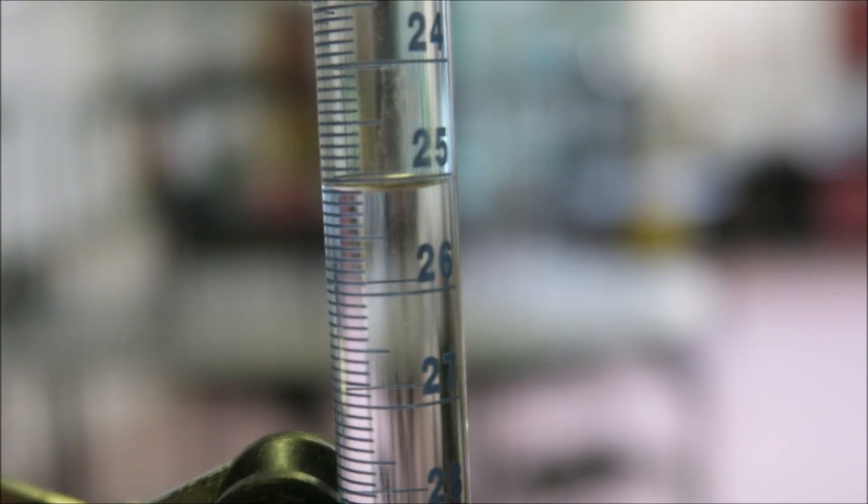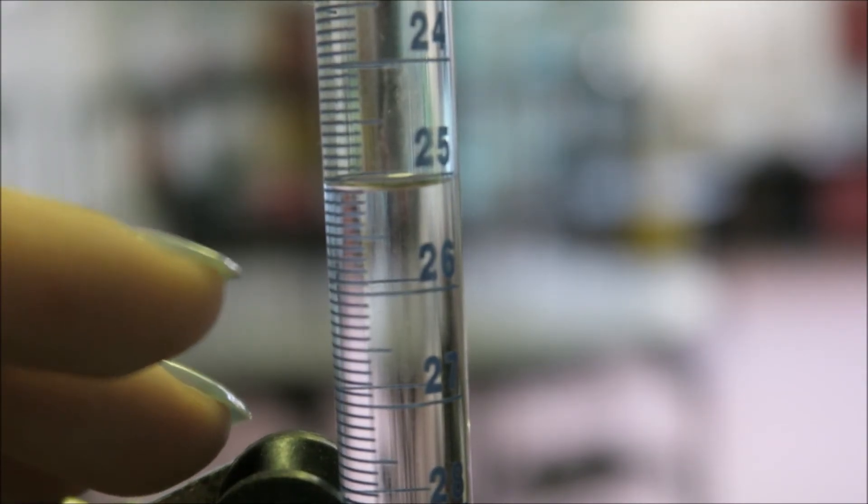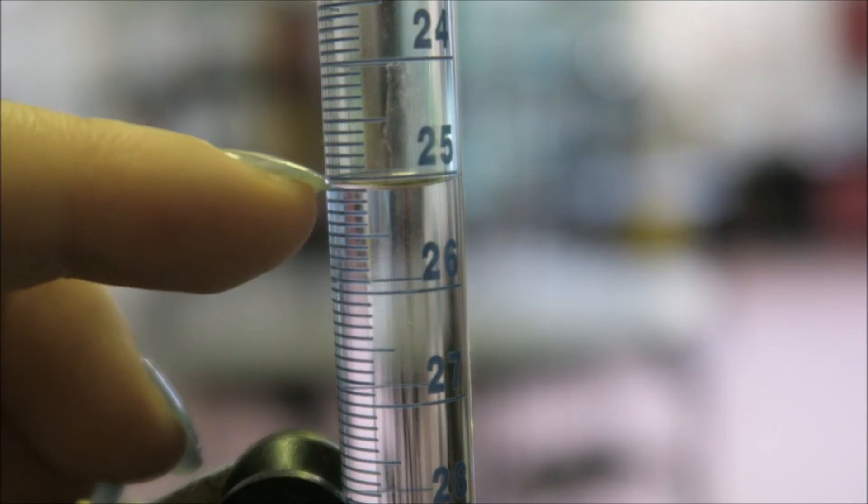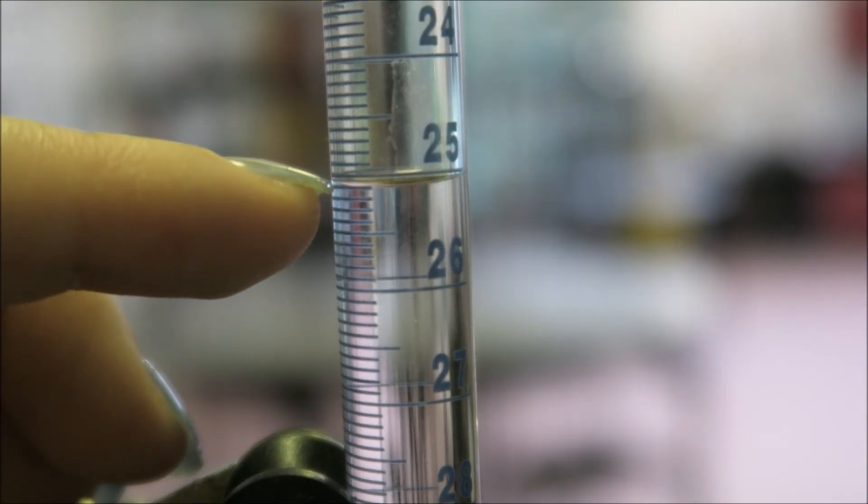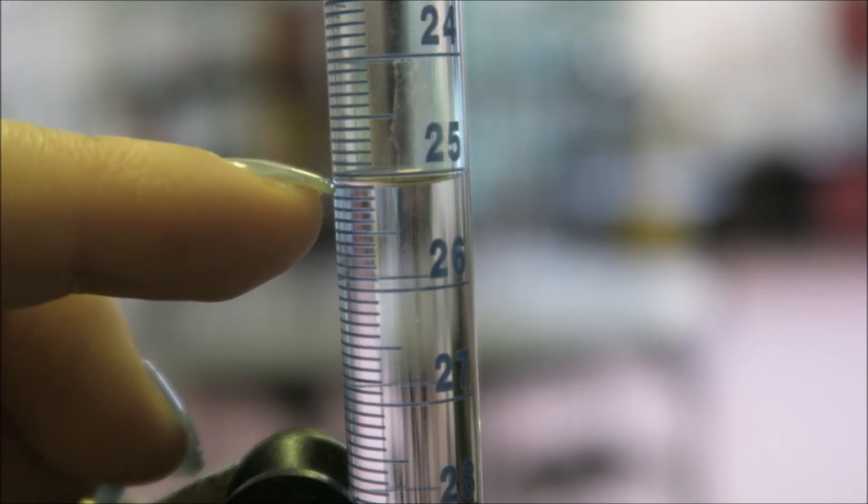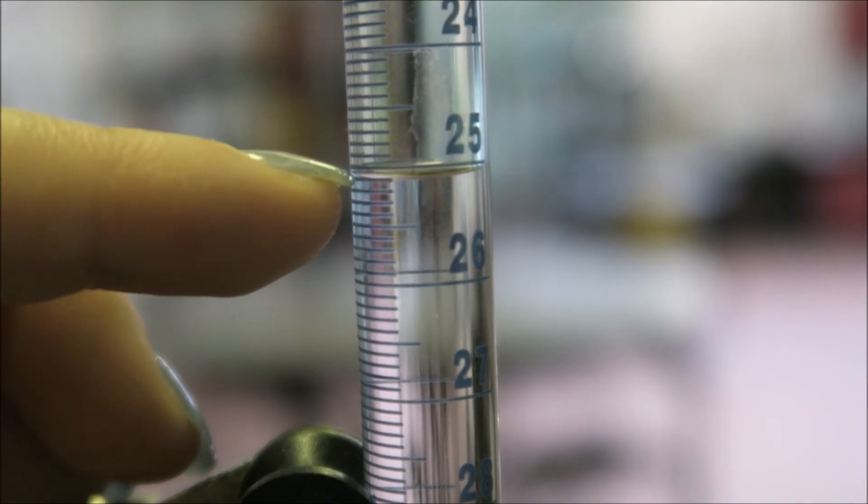What is this reading on a burette? Again, having to bend our knees. We have 25, we have 26, here is 25.1, so it's 25.10 centimeters cubed.